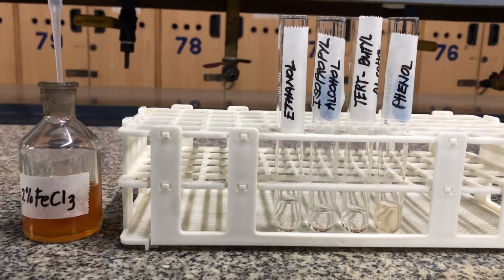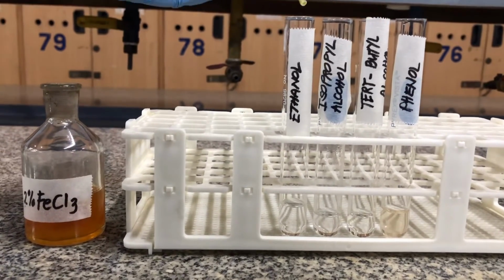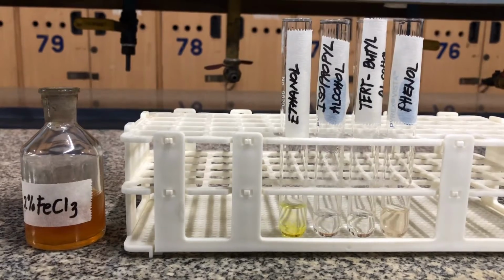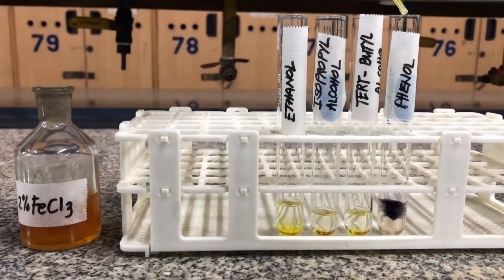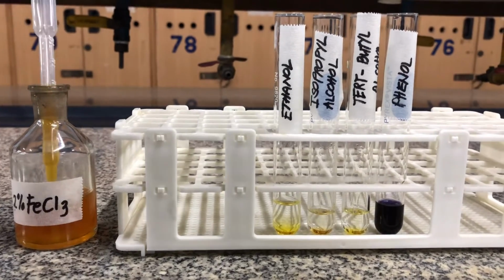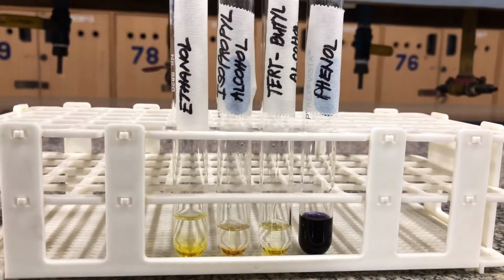The test is very simple and is just conducted by adding 1 drop of ferric chloride into test tubes containing already the representative alcohols and phenols. The formation of purple coloration is a positive result which indicates the presence of phenolic group.